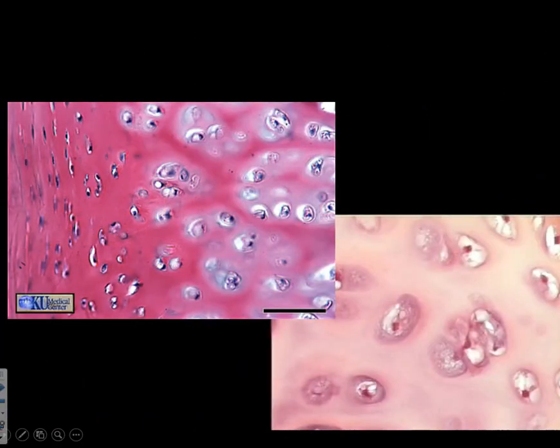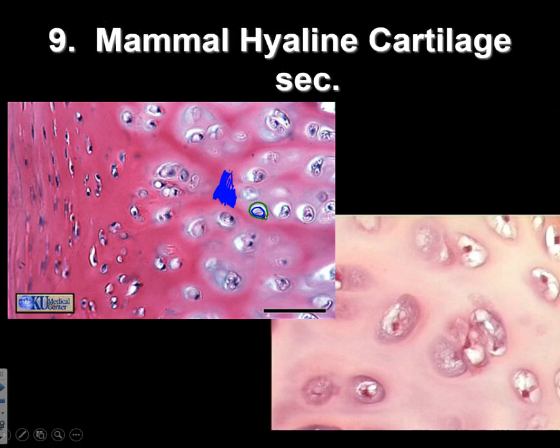All right. Here's one. Here we can see the lacunae much better. There's that little cave. Inside that cave, we have the cell. In this case, it's a chondrocyte because this has this really smooth extracellular matrix here. Almost looks like plastic. It's very cool to look at under the scope. That is the dead giveaway that we are looking at hyaline cartilage. Okay, we got lacuna with cells in them and a lot of extracellular cartilage matrix.